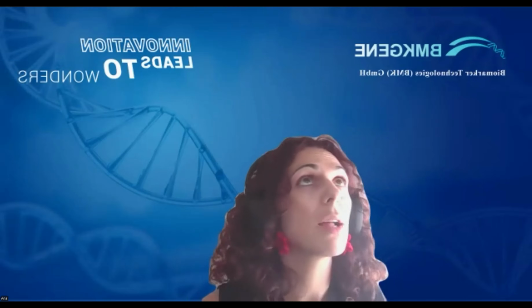Okay, thank you. So we only have time for the last one. The question is about analysis as well. How do you calculate beta diversity? And can I use the platform for these calculations? I think they mentioned the BMKCloud platform. Yeah. Okay, so starting with the last part, yes, for sure you can use BMKCloud to do the analysis.